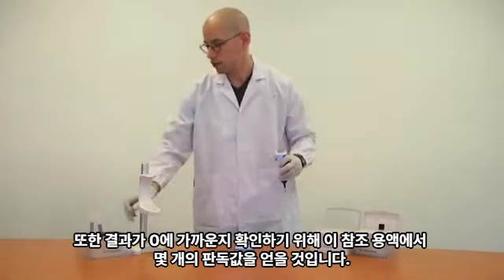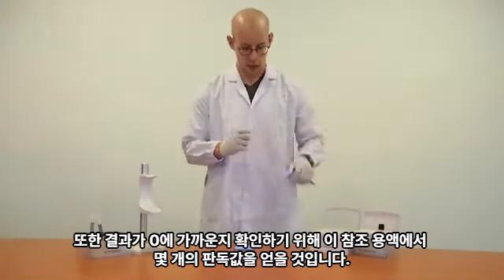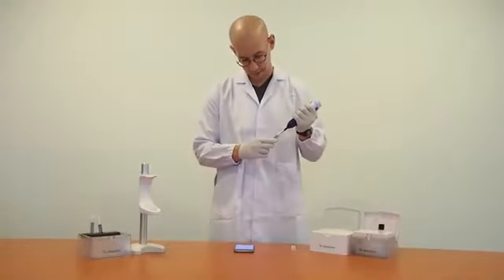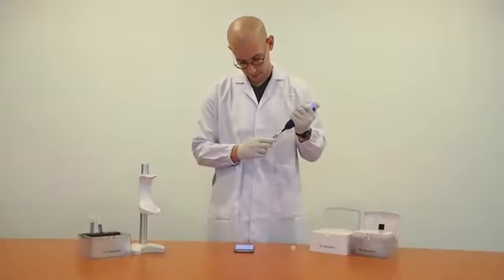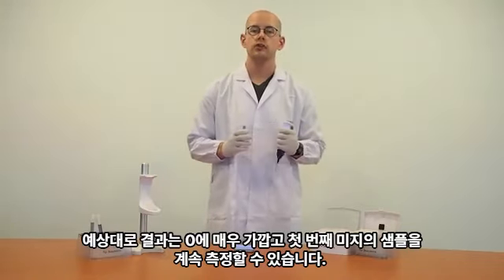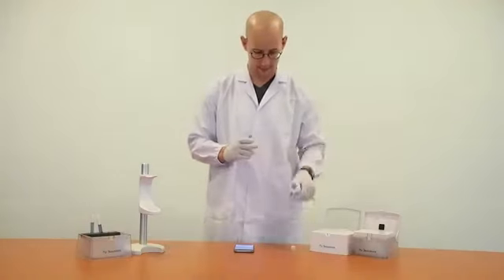I will also take a few readings in this reference solution in order to verify results are close to 0. As expected, results are very close to 0, and we can continue measuring our first unknown sample.